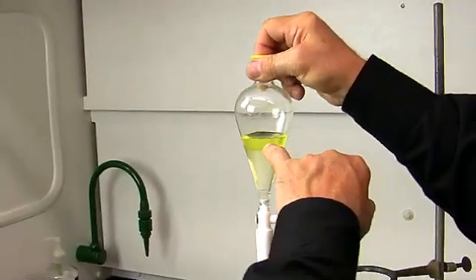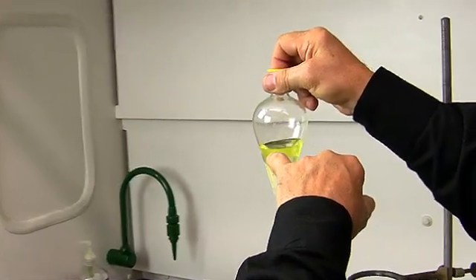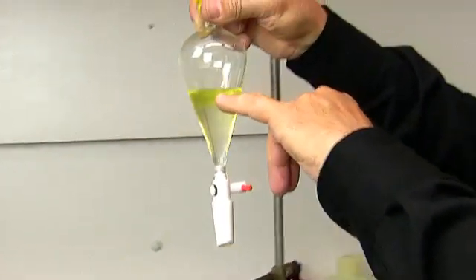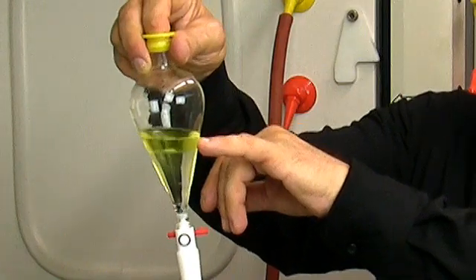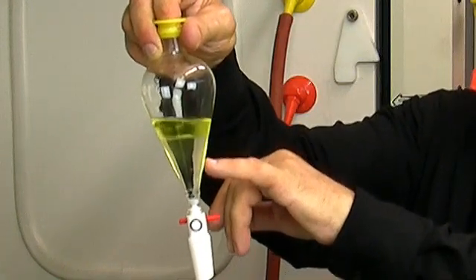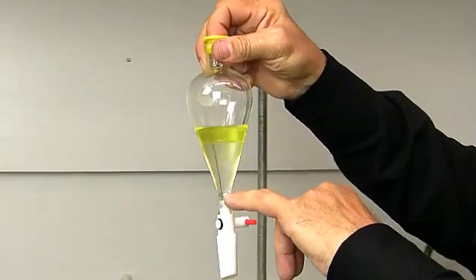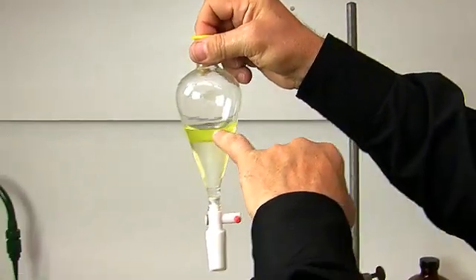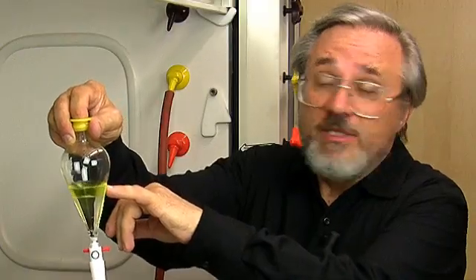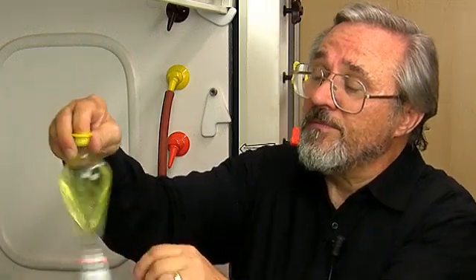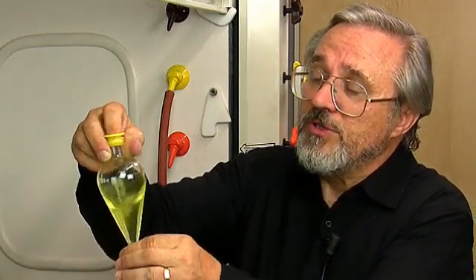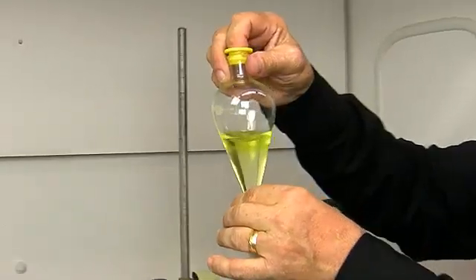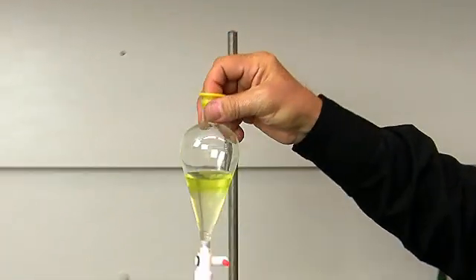You can see that the lighter layer, the diethyl ether layer is on top, and it still has the fluorenone in it, but the lower aqueous layer is colorless. So the fluorenone, at least in our observation, is still in the diethyl ether layer. I'm going to swirl that around a little bit more so that we get all that solid dissolved. And there it goes.